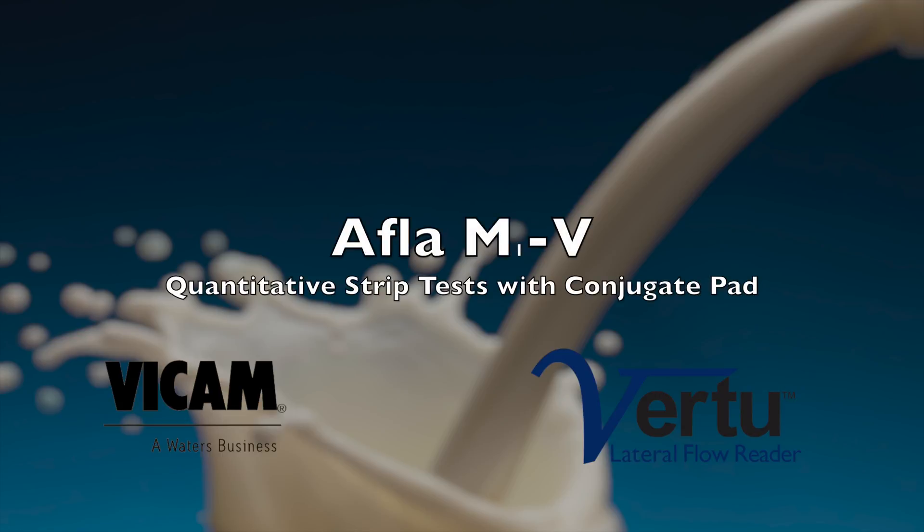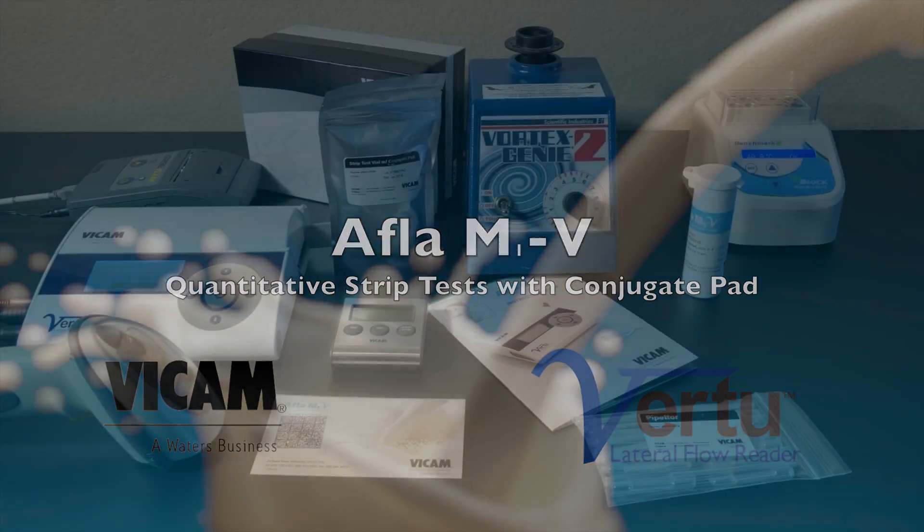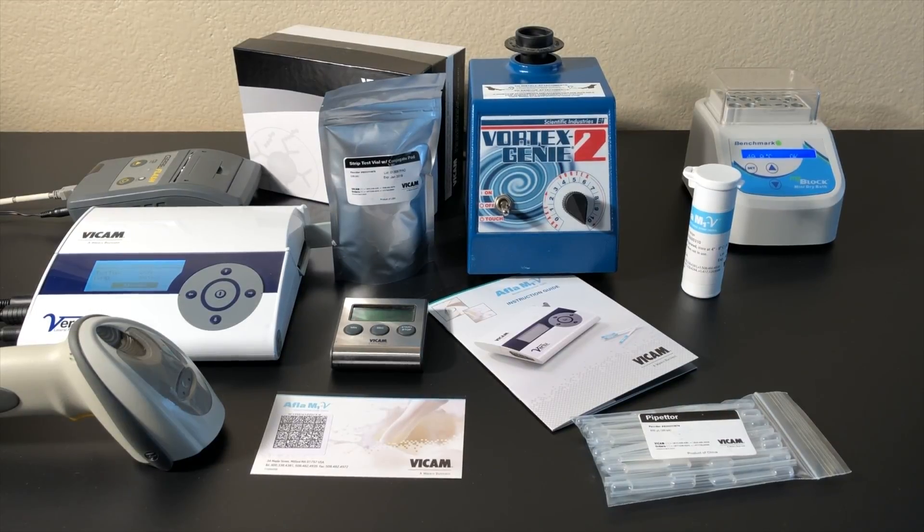The Vicam AFLA M1V Quantitative Strip Test with Conjugate Pad is used for the detection of Aflatoxin in raw or whole milk.